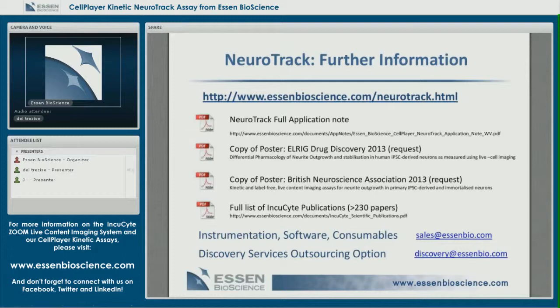Can you remove a scratch track manually? Yeah, good question. I'm not sure that you can. On the TPP plates that I mentioned, we see very few, if any, scratches. We typically run multiple images per well, and often multiple wells per plate for the same treatment group. So our solution to that would be to exclude a whole image from the analysis if we felt that the image quantification was compromised by an artifact arising from a scratch or any other imperfection. But I'm not sure in the software that you can manually remove a scratch. I will double check that for you and reply by email afterwards.